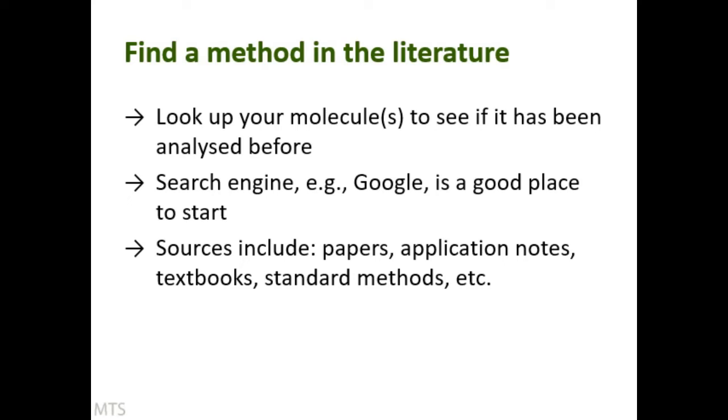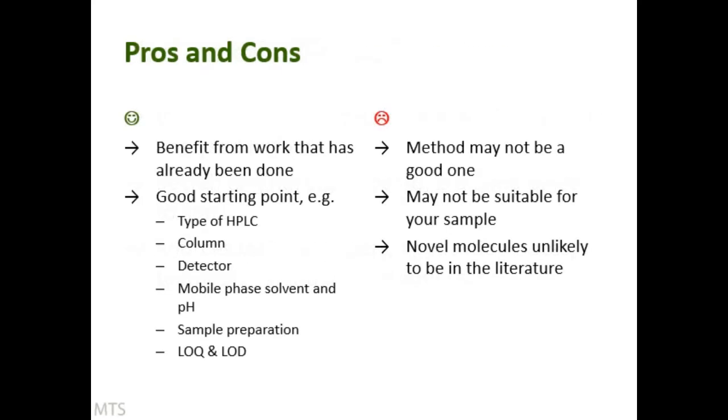So let's have a look at the pros and cons. The obvious benefit is that the work's already been done. We like that. That would be good. We can have a method without very much effort at all. The downside, I'll go over here first of all, is that it doesn't necessarily mean it's very good. So you don't know about the capabilities and understanding of the person who developed that method.